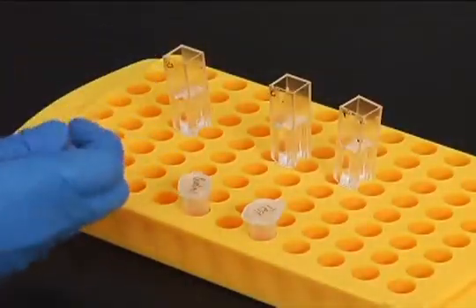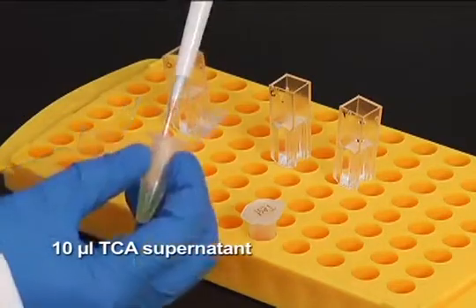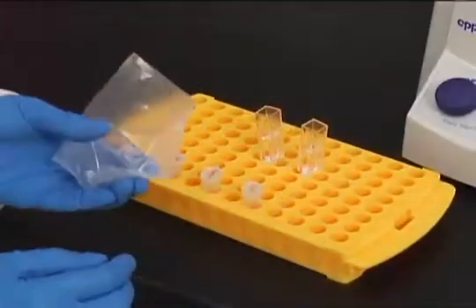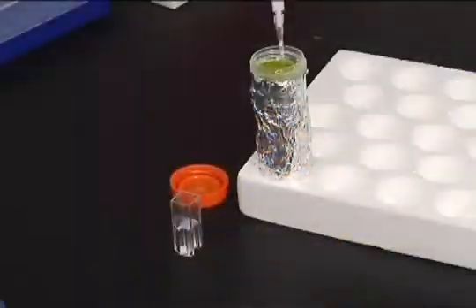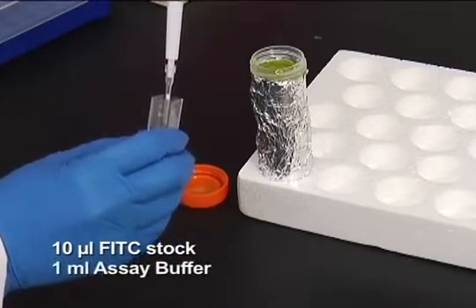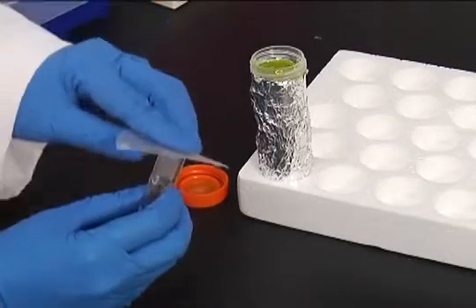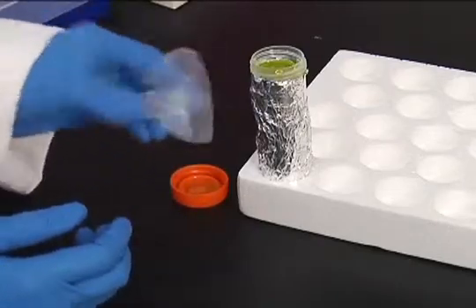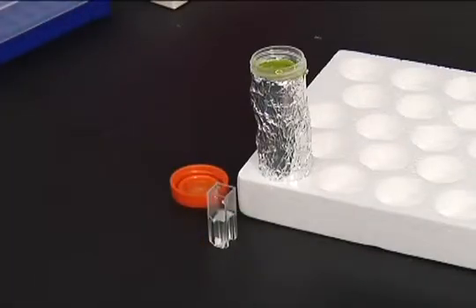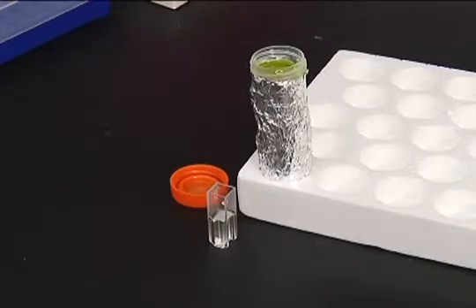To measure the protease activity using a fluorimeter, combine 10 microliters of the TCA supernatant with 1 milliliter of the assay buffer in a tube and mix gently. In addition, dilute the FITC standard for analysis by adding 10 microliters of FITC to 1 milliliter of assay buffer. The FITC control and trypsin standard give a fluorescence level that the sample should not exceed. The solution of the TCA supernatant and assay buffer may be stored in the dark at 2 to 8 degrees Celsius for up to 24 hours before measuring the fluorescence.